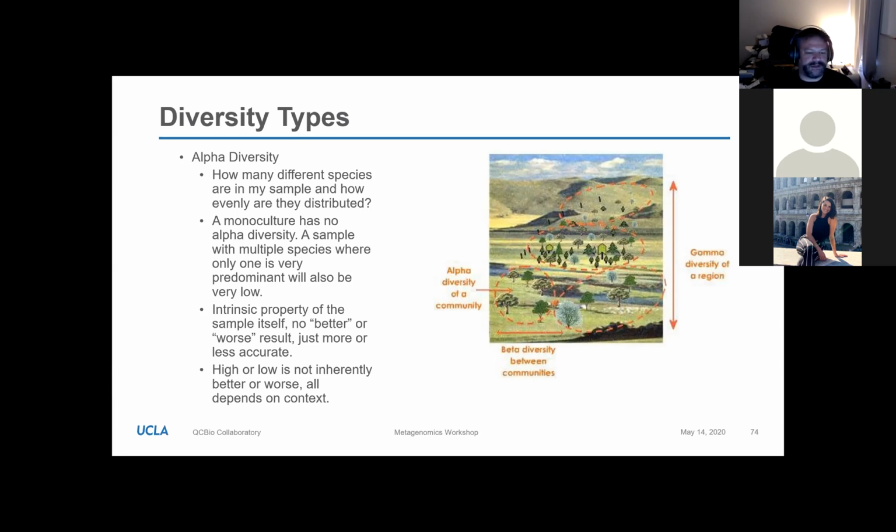And another scenario that comes up a lot is, I showed earlier how firmicutes can be underrepresented due to poor lysis. So if I have a sample that has a large number of gram-negative species in it, but is almost entirely, let's say, 80% firmicutes, it should have low alpha diversity because you have basically a predominant firmicute. If I were to underlyse that firmicute, I could actually see the alpha diversity improve just by the fact that I had a predominant species and I made it less predominant due to technical issues. I just underlysed it and didn't pick it up. And now all of a sudden, the less predominant species become more predominant, which makes my alpha diversity look better.